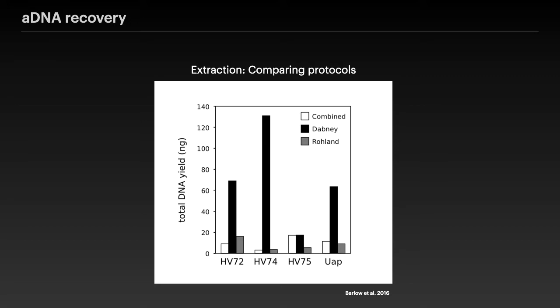So I will show you more graphs about the effect on the fragment length distribution by this extraction method, but we'll talk first a little bit about the library protocol. So we'll move on to the library section.